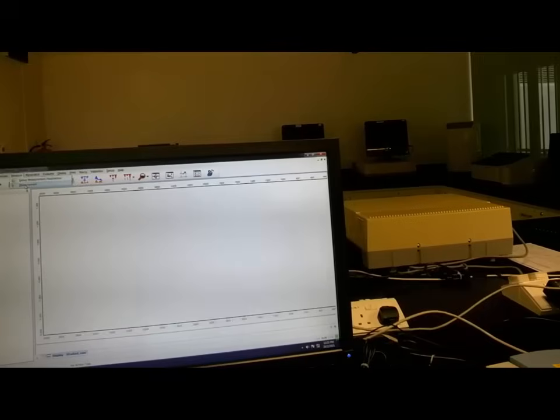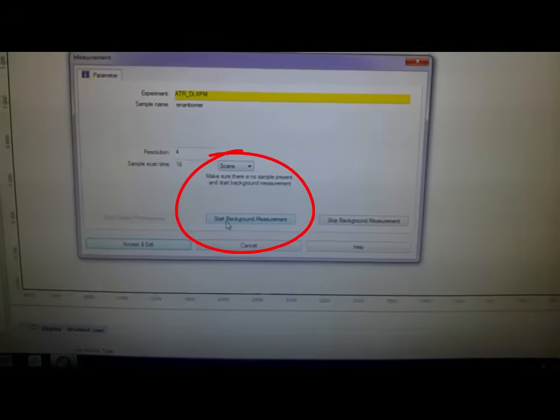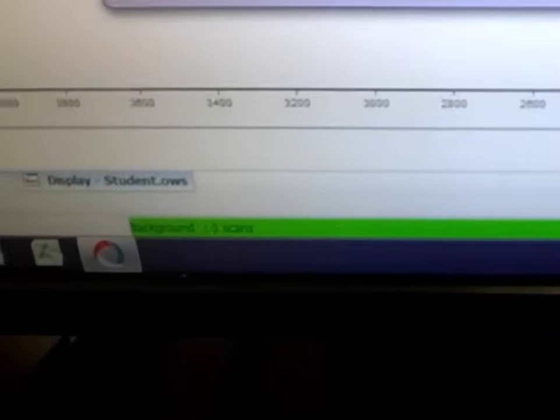So now we click on the measurement, and you see that — in the middle of this icon — start background scan. The resolution should be about 4. Scan time 16. These are the default adjustments, so you do not have to change the parameters.